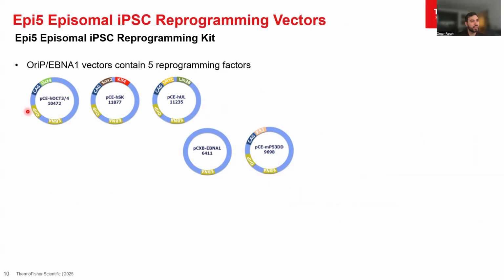Yes, I'm going to talk about this, Tyler, a little bit more, but basically for mRNA reprogramming methods, the protocols that we have and the kits that are commercially available typically require an adherent cell type to reprogram with mRNAs, because you're going to be delivering your mRNA into these cells, right? And blood-derived cells or PBMCs are cultured in suspension. So it's a little bit harder to do that when the cells are floating around as opposed to being attached onto the plate. And that's why we typically need to differentiate them into endothelial progenitors to make them into a monolayer culture of cells that are proliferative and then start our reprogramming.